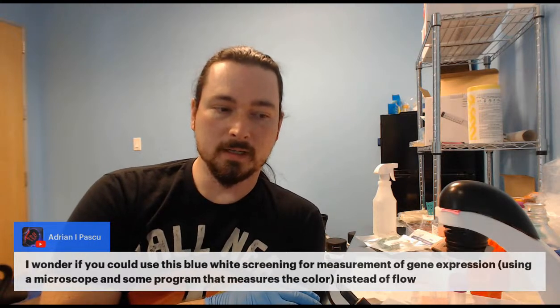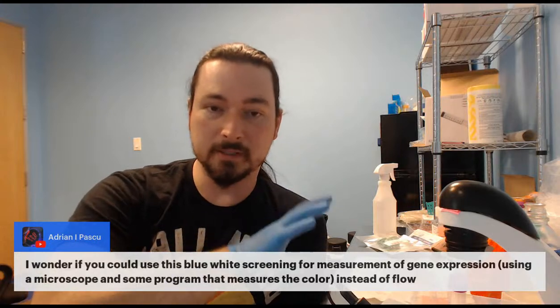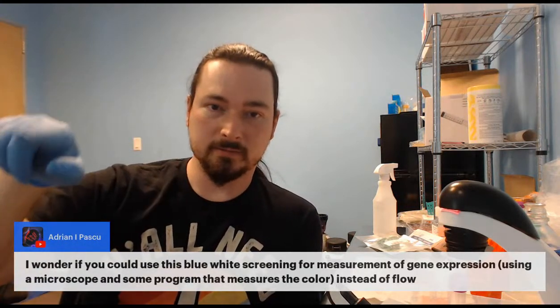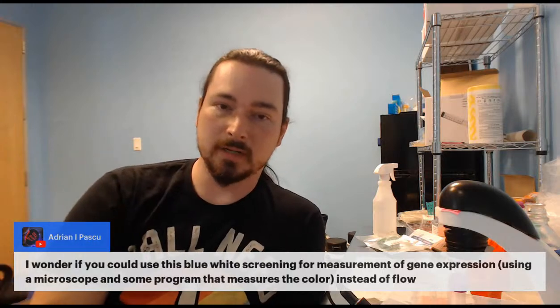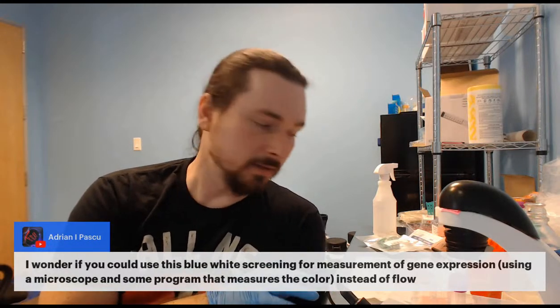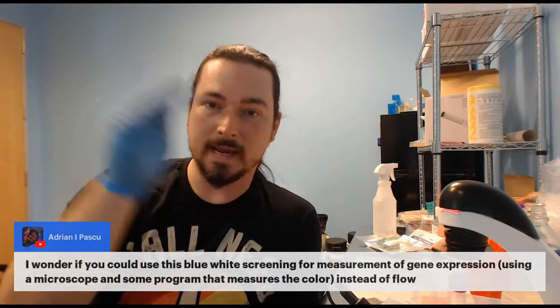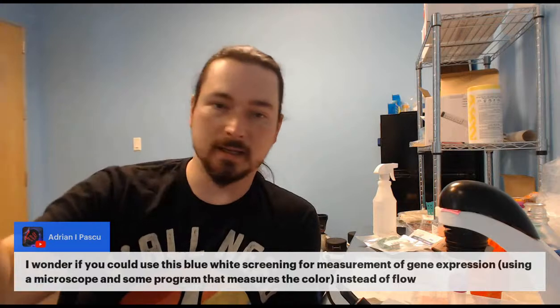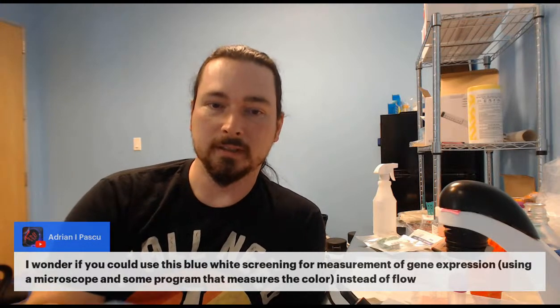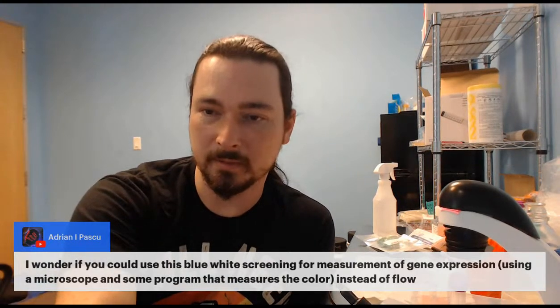Because expression of this plasmid is going to peak at a certain time, it's really time sensitive, and sort of exaggerated by the fact that it's an enzyme, which is why we didn't use GFP or something, because this is going to be a stronger signal. You can sit there with half the enzyme and wait longer and get a stronger signal. So you have to build in the timing just perfectly, and the number of cells and all sorts of stuff. You probably could do it, but it'd be tricky.